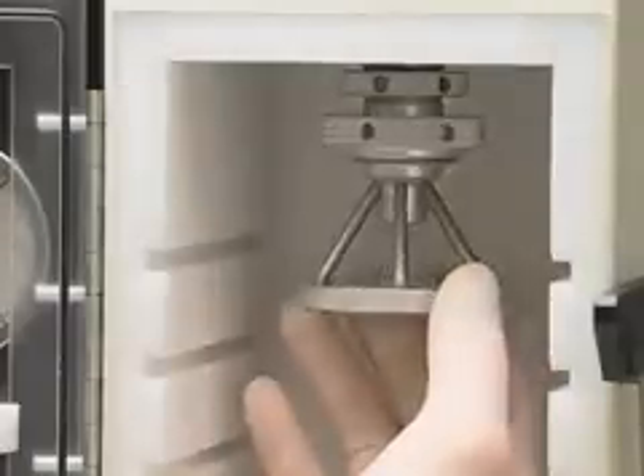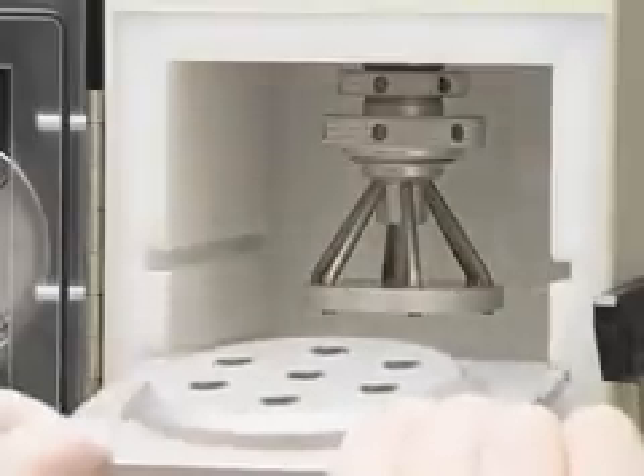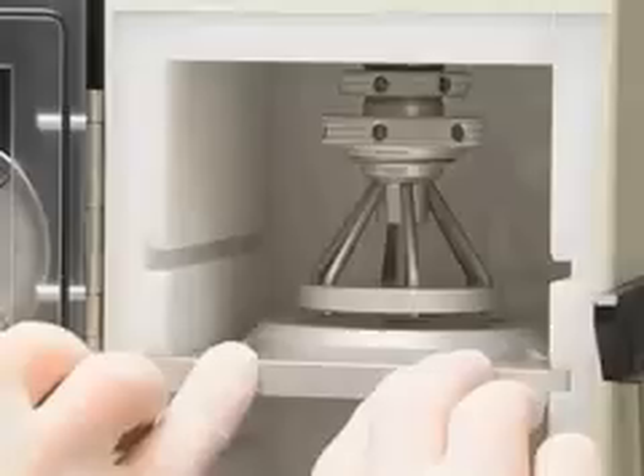Loosely screw the top of the seven-arm gas divider into the parts already inserted into the chamber. Slide the macro carrier shelf assembly into the second shelf position with the seven holes of the macro carrier holder facing up, and line up the seven pressure outlets with these holes.